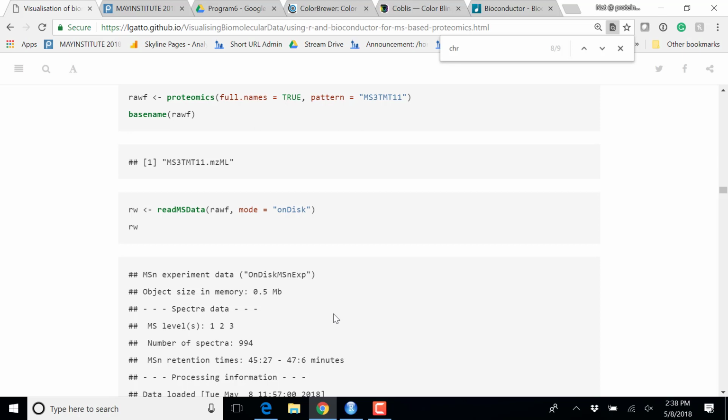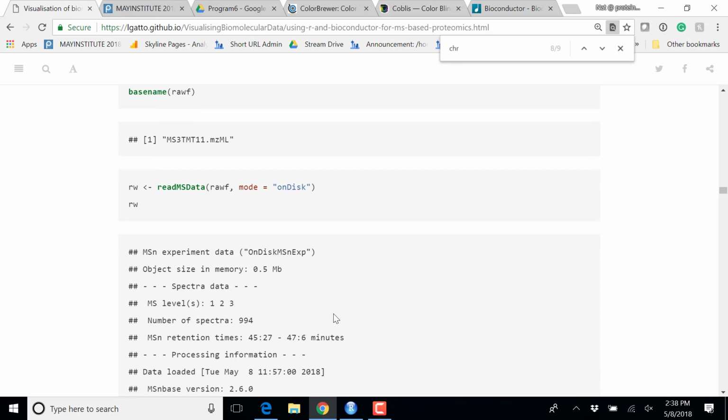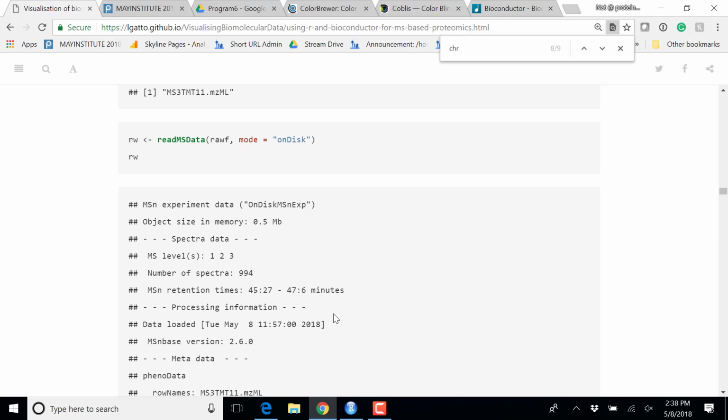And same thing if you used mzData or NetCDF. Are there more features for one versus the other? At this stage, it doesn't really matter, but of course, if you have specific annotations that are only present in mzML, for example, then if you export your data into one of the formats that don't support these CV terms, then they will not be available. But packages are written so that you would use the same functions, the same syntax, irrespective of the original raw data file.